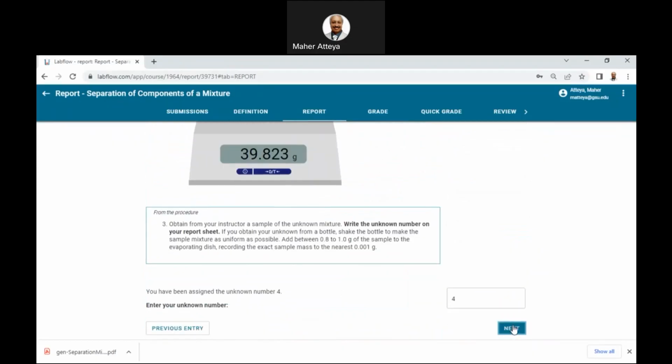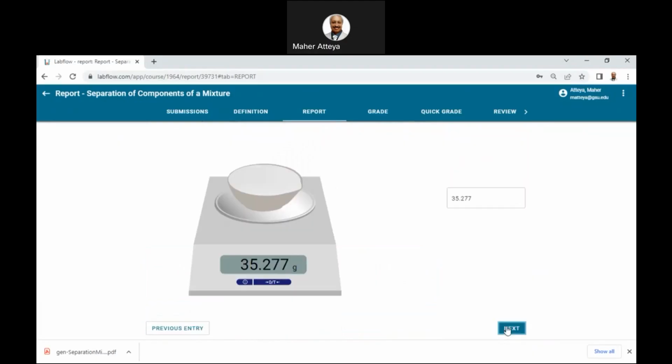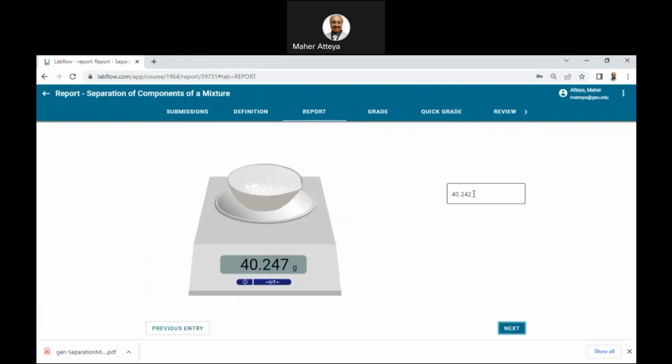Okay, I see the error. You can see it by 35.277, and I can see 8.23. I fixed the error here, supposed to be 7. Here it is 247. So the error is fixed. And I said it is new.